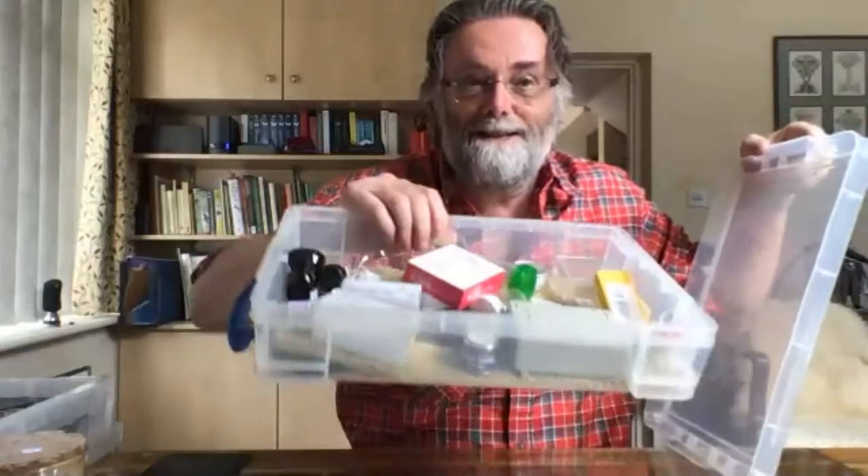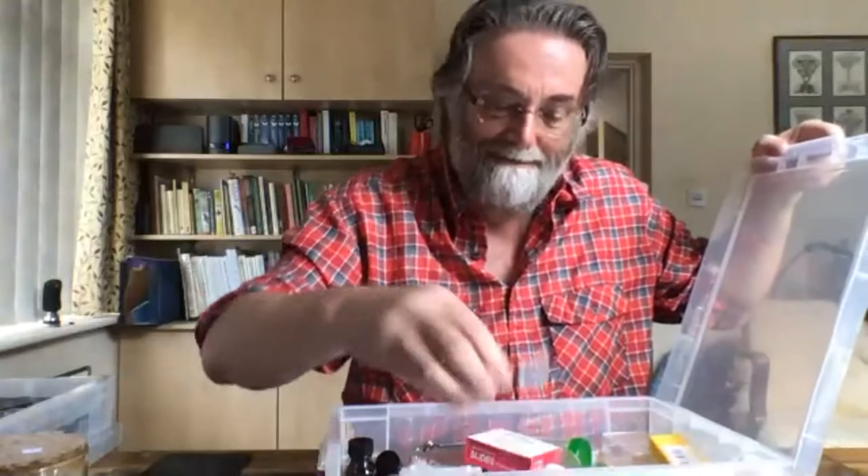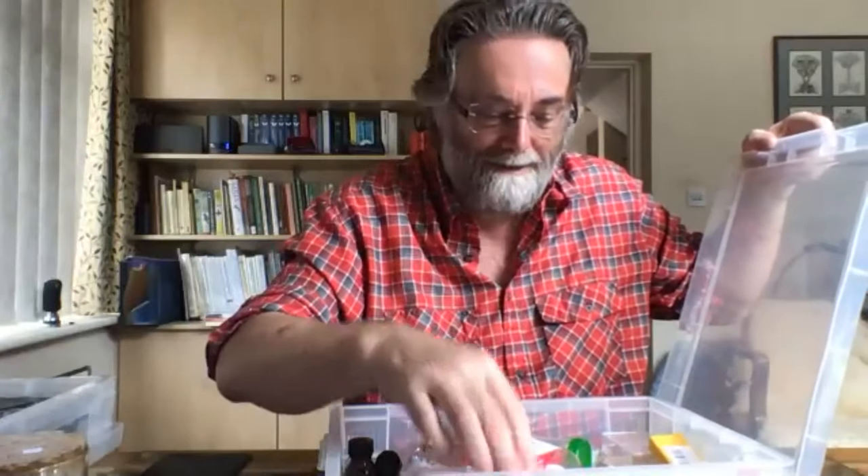That's all the microscopy bits, and it includes some lovely things like purple nail varnish to ring the slides. You know what slide ringing is. Let me show you while Paul is reaching over.